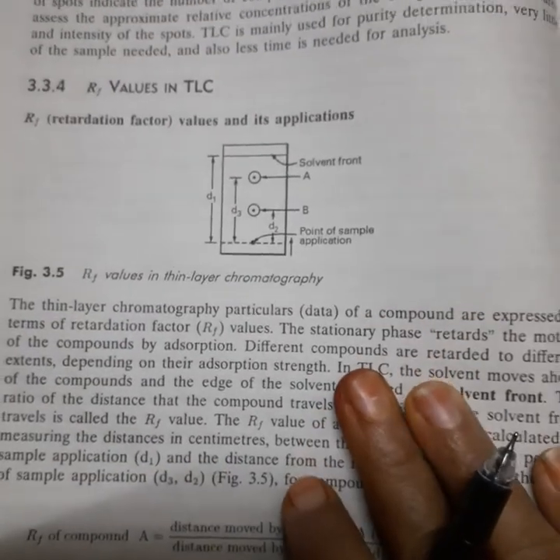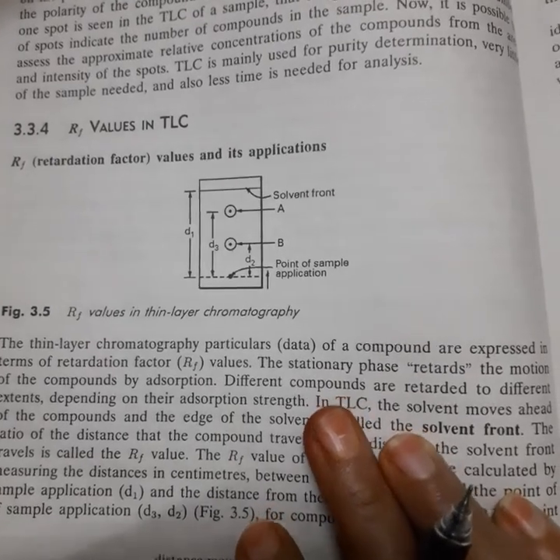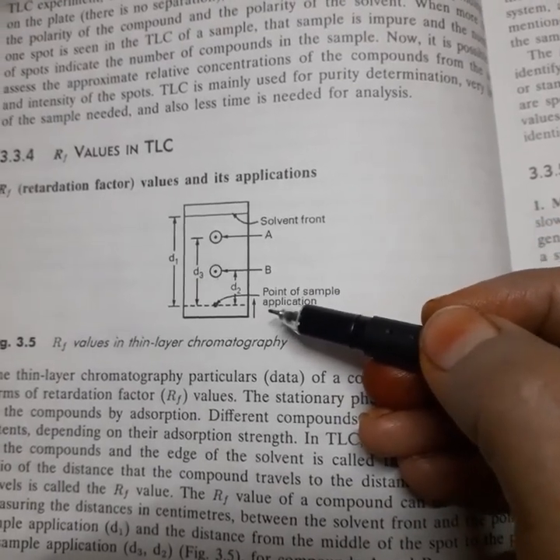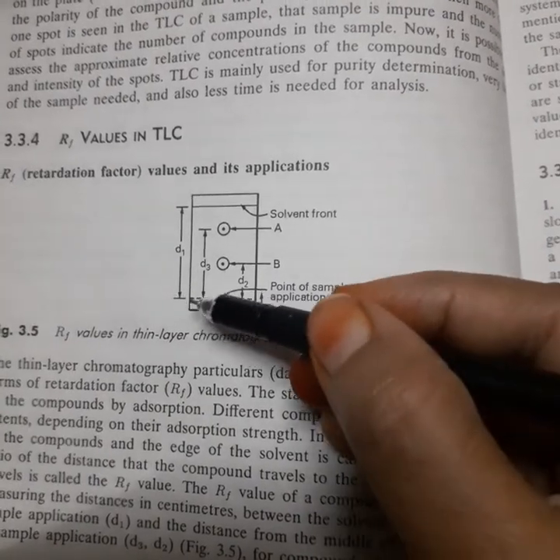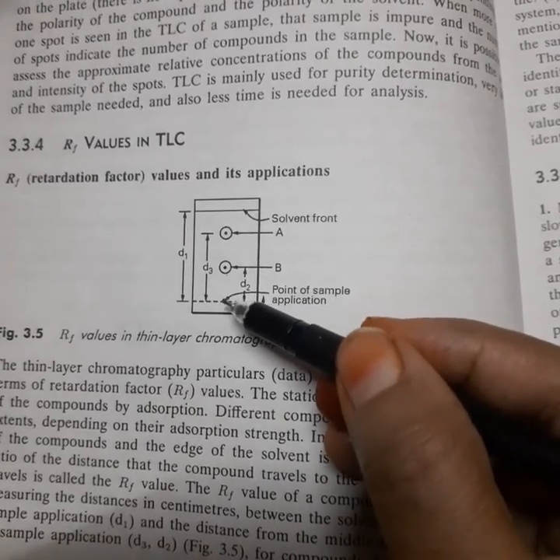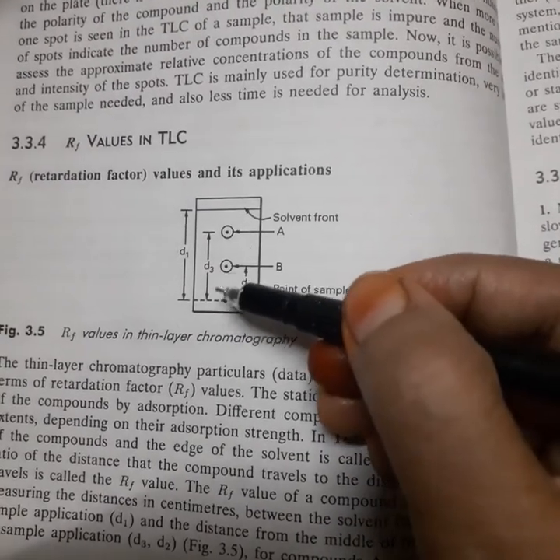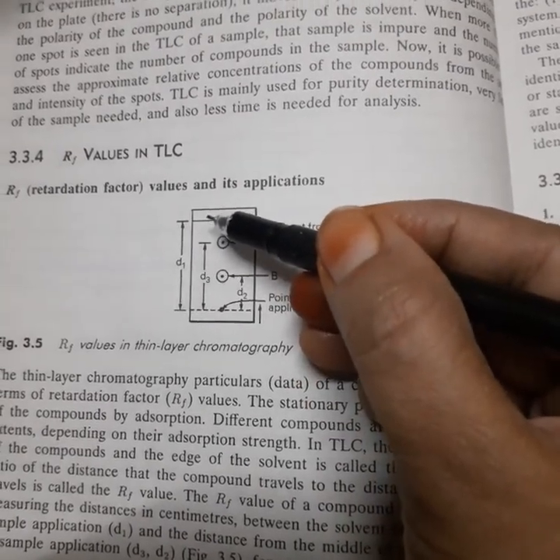Now, because here the stationary phase retards the motion of compounds by adsorption, generally the speed with which A and B move will depend upon the adsorption strength towards this stationary phase, right? So from this spotting level, where I put that spot here, you need to mark this distance as D2 and this distance as D3, and from here to the solvent front is D1.